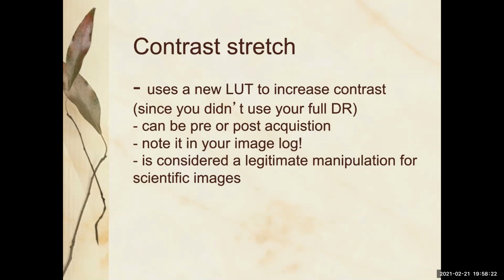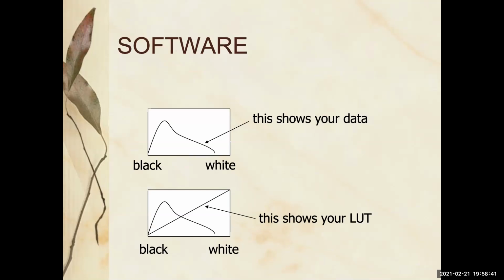We're going to talk about this a little bit more later. And I may have said this, if something drops into the middle of your image, you're stuck with it. You can't just Photoshop it to make it disappear. You have to either use that image or find a different part of your specimen that doesn't have a bit of cotton that flew in or something like that. Cotton fluoresces a lot, especially the really bleached cotton that is on our t-shirts and lab coats.